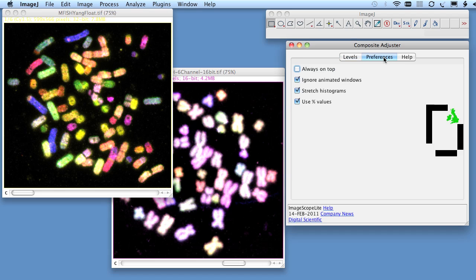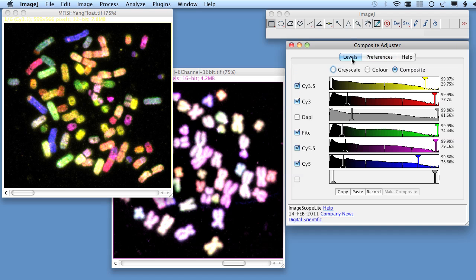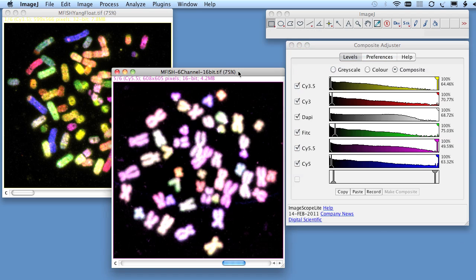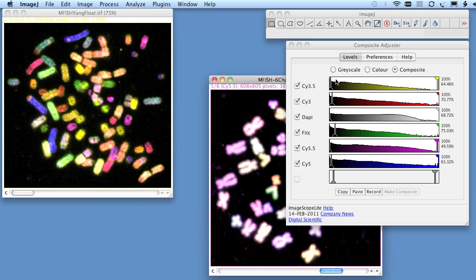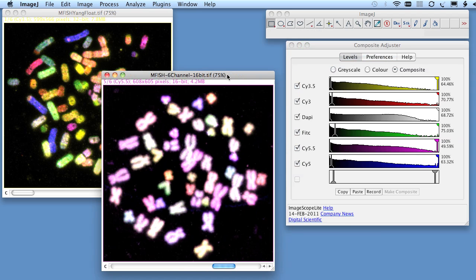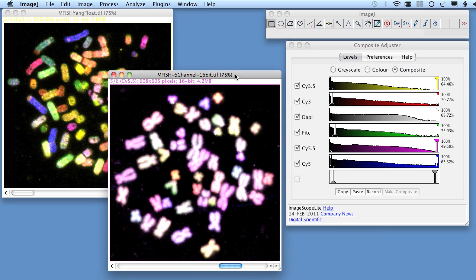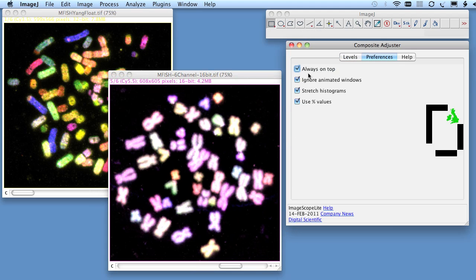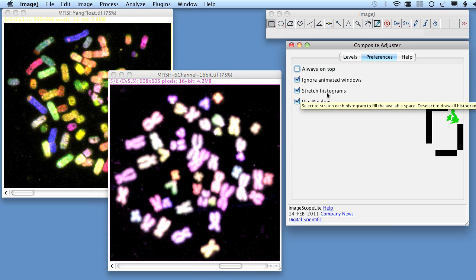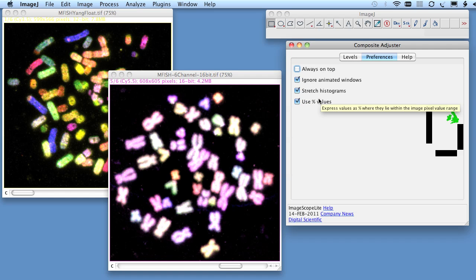Under the Preferences tab, Always on top allows the Composite Adjuster palette to float above all other windows. Stretch Histograms and Use Percent Values determines how histograms behave and how they are drawn.